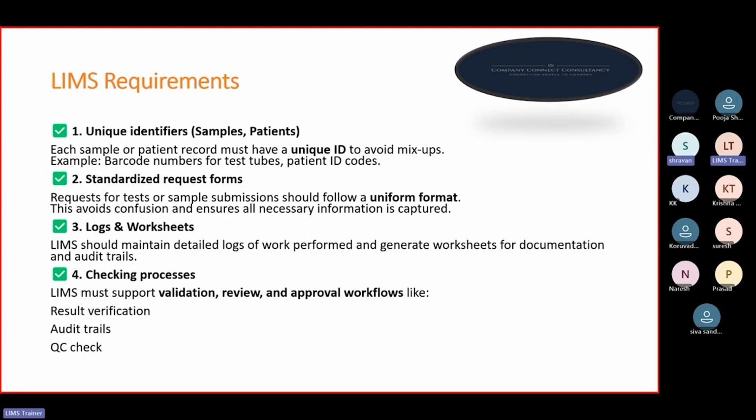There will be different environments at the time of implementation of a software: development environment, quality environment, validation environment, and then production environment. So 3 to 4 environments are there. You cannot just create a software and hand it over to the client. There are some procedures you need to follow. First, you will develop the software in the development environment.